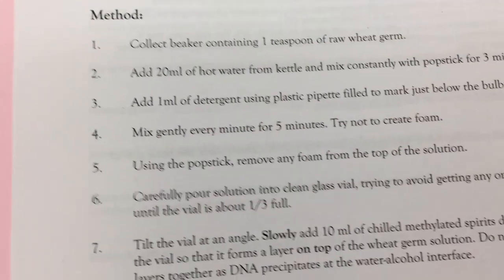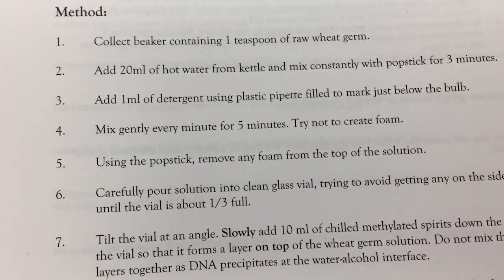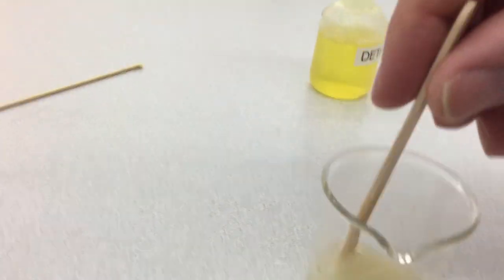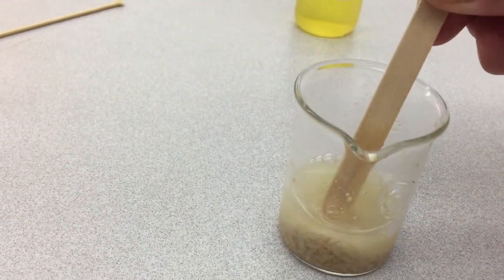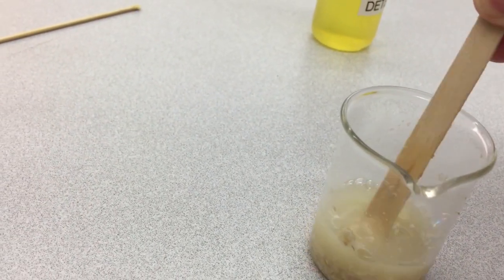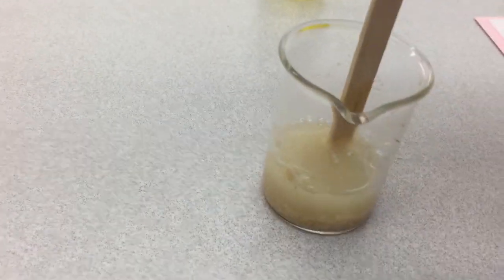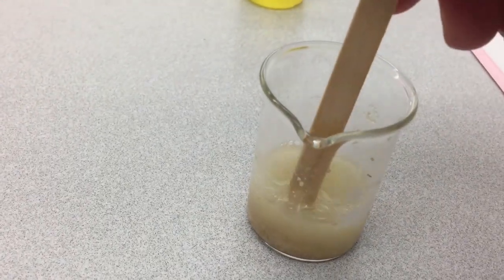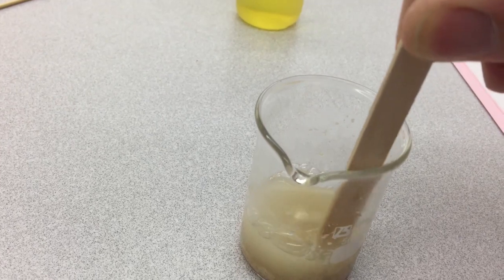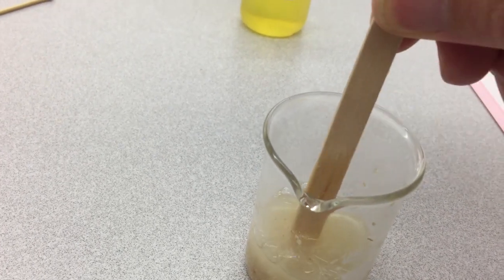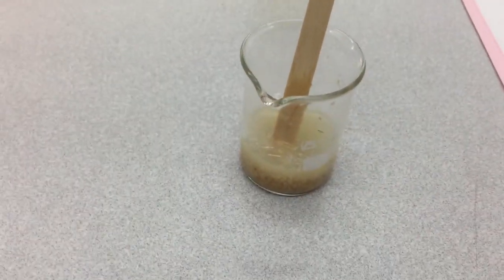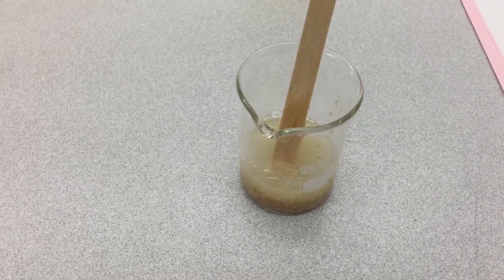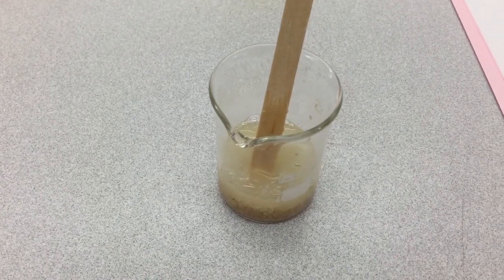And step 4 is to mix gently every minute for 5 minutes. Now this really is a very gentle mix. We're literally going to fold it over and gently move the detergent around. We want to try and create as few bubbles as possible. And now I'm going to leave it for 1 minute, and then do the same again once per minute for 5 minutes.